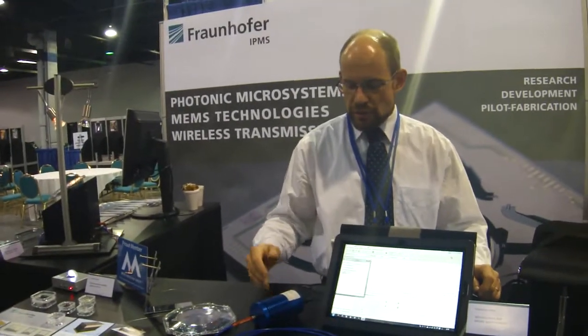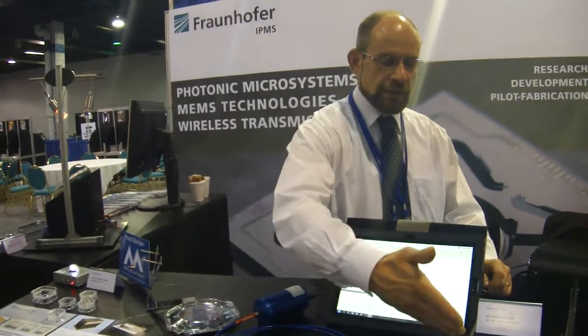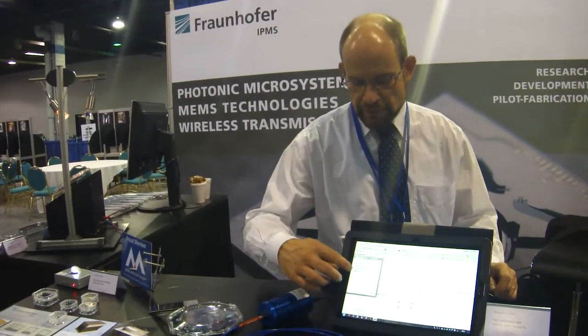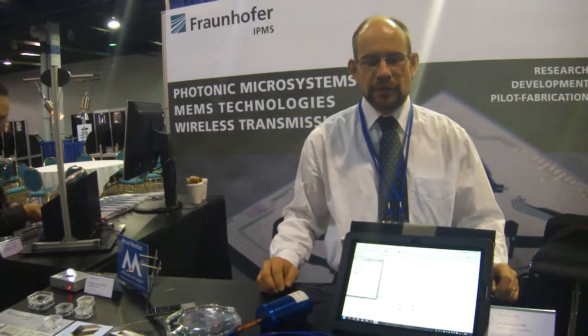On this device here we show how we measure the alcohol content of a liquid solution, applying a light source, optical coupling, a MEMS spectrometer, and the software on the computer. Finally, the alcohol content can be computed.